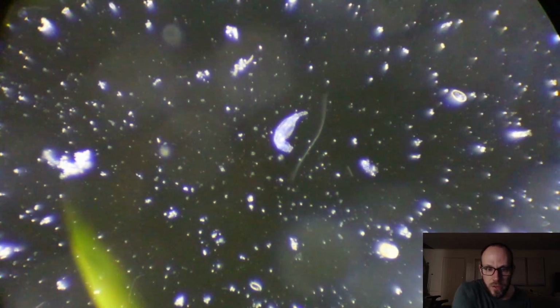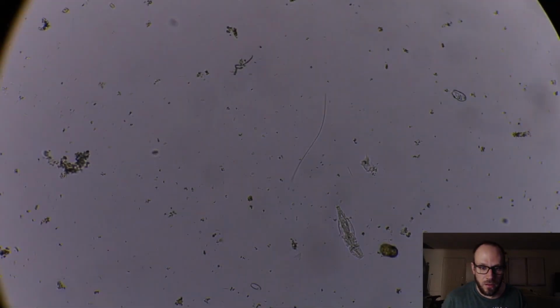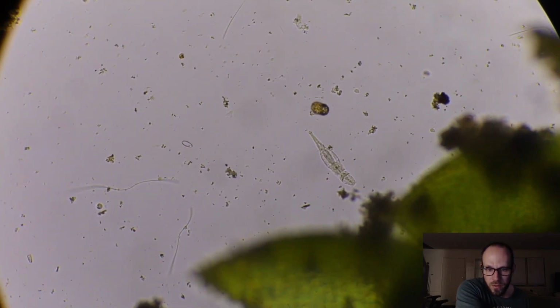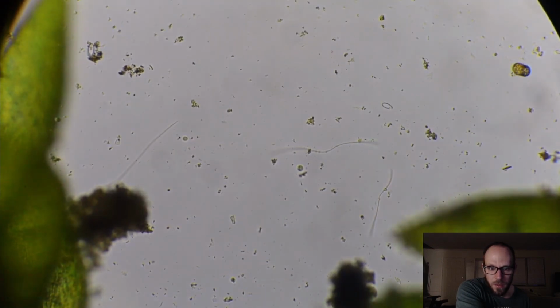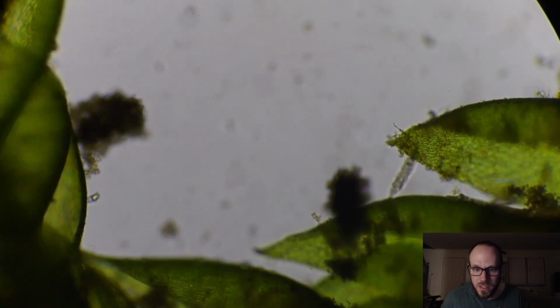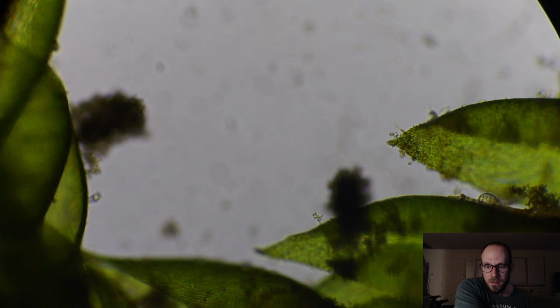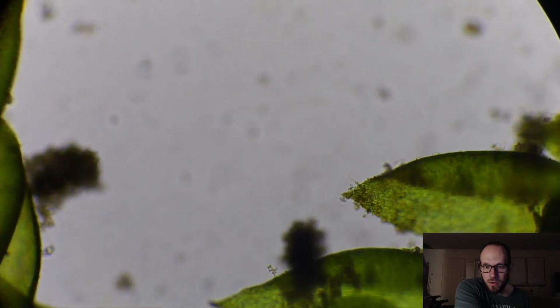Oh, are you gonna do it? Come on, do the thing. We can look at him under Brightfield. I'm actually impressed at how well Brightfield does with this. And you can see there's crud following us along, probably on my condenser. But the wonderful thing about this slide is there's so much to be found. Like, this is a different rotifer than the one we were just looking at. It's a whole little universe in here.